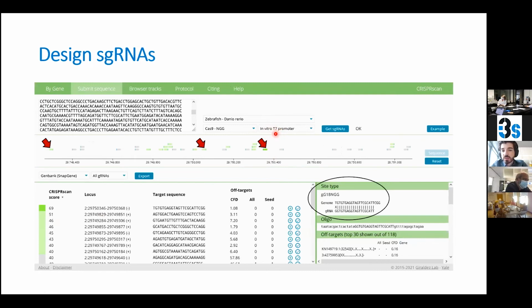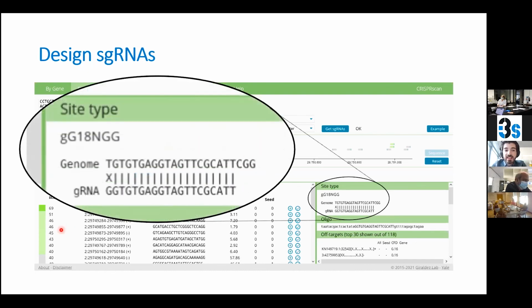It is a bacterial promoter, and it has the particularity of requiring that the beginning of the sequence be a GG. So what the software does automatically is that if the first two nucleotides are not GG, it makes them GG. In this case you have 19, but you could end up with only 18 nucleotides homologous to your target region. But that has been shown to be more than enough to efficiently target Cas9 to cut DNA. People have shown that even 15 nucleotides is enough.